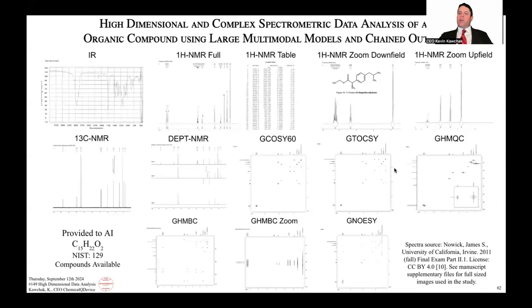Now, all three of the recent manuscripts are up. The first one is more general. It talks about using these types of software for AI across many different use cases, reactions, synthesis, and also finding biochemical enzyme specific information buried inside a ton of data and a ton of text. And it does that quite easily. The second one was basically like this, but scaling across 3 different data sets. And again, with one of them, I actually got the correct unknown 3 times. And then this one, I believe the same case, but on a much bigger scale, and with a single big problem.